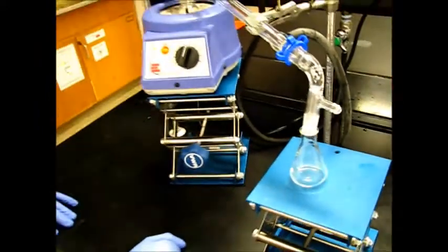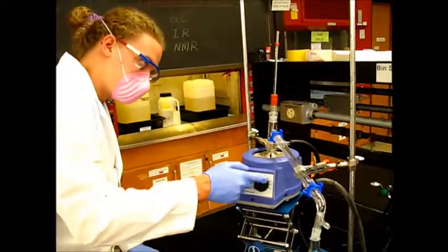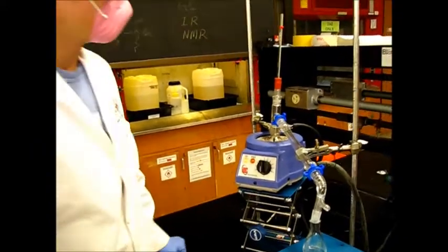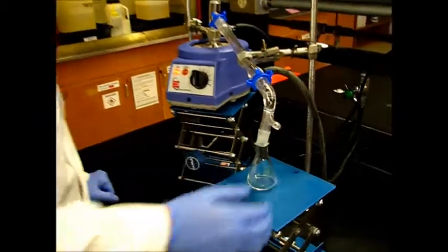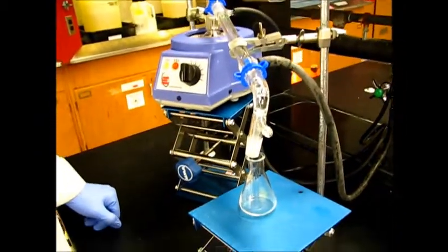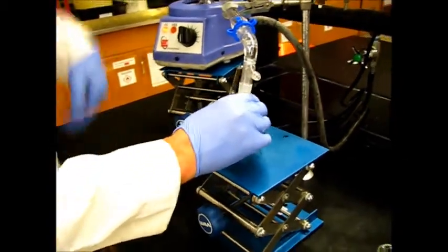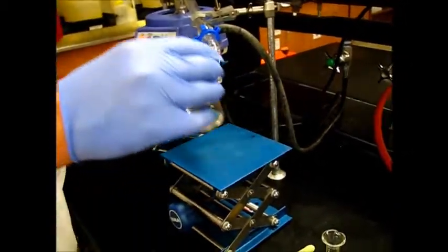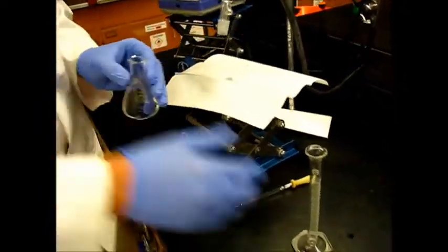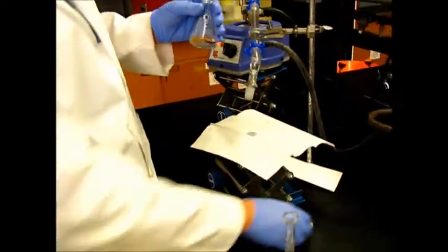So we've been distilling for maybe 15 or 20 minutes. It's at about 150 degrees Celsius. I'll go ahead and turn that off. So this stuff right here is our product. This is all our byproducts or waste. We're going to get those last couple drops. So we're going to get a volume for this so that we can get our percent yield.